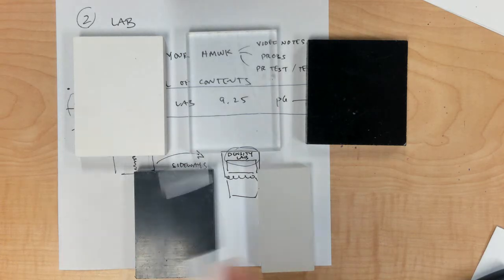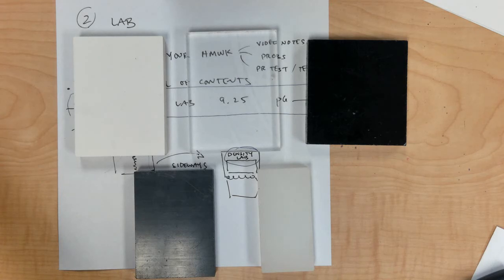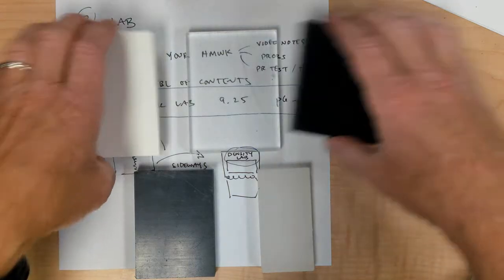Once we have the length, width, and height, then we can calculate length times width times height, or the volume of the block. And then once we have the volume, we can take the mass, divide it by the volume, and calculate the density for each one of these blocks. Therefore, the name of the lab is the density lab.